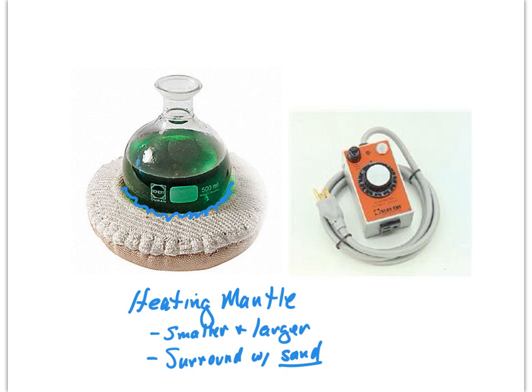Now this round bottom flask is probably overfilled, right? You only want it about half full. So you pick your round bottom flask size to give you maximum surface area. And the maximum surface area is when that round bottom flask is about half full. And then that gives you room for bubbles to form without those bubbles splashing out of the round bottom flask up into the condenser. Okay?